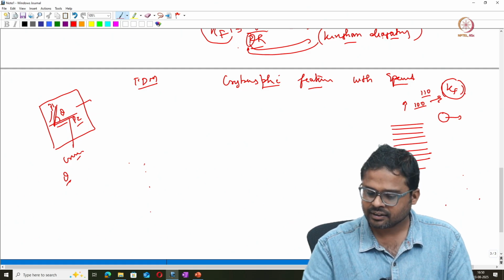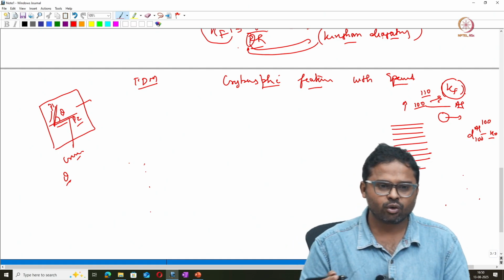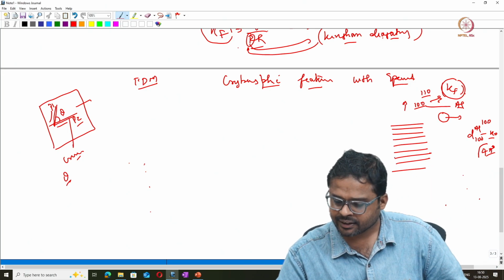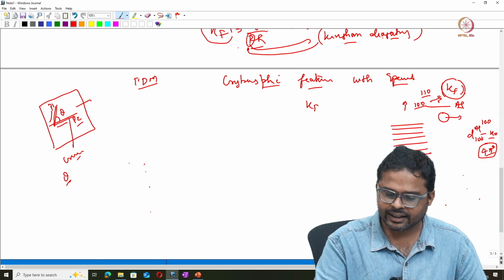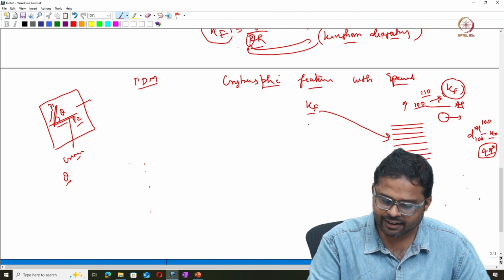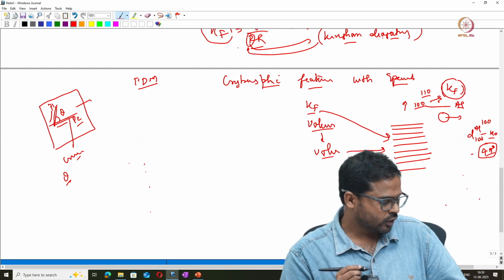And if you know the material, for example aluminum, we know the d spacing of 100 of aluminum, which might be around 4.03 Angstroms, correct? Assuming about 4 Angstroms, this value can be used as a constant, and you can calibrate your kf to the need, so that your reconstruction is done in such a way that at different values of kf, you can get a value which shows that your d spacing is near to or equal to 4 Angstroms.